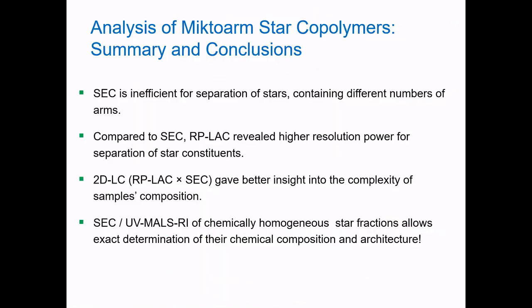The summary of this work reveals the higher resolution power of liquid adsorption chromatography as compared to size exclusion chromatography for separation of star constituents. Two-dimensional liquid chromatography gives better insight into inhomogeneity of the samples. By analyzing the chemically homogeneous fractions with size exclusion chromatography coupled to a multi-detection system, we were able to determine the exact chemical composition as well as the architecture of individual star constituents.